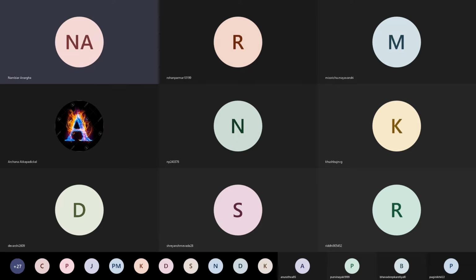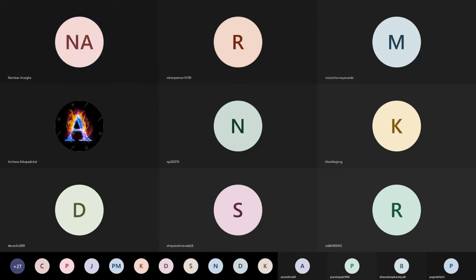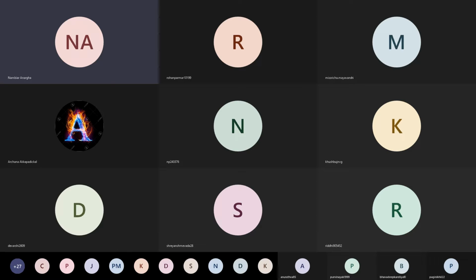हम लोग प्री सैचुरेशन यानी we are pre-saturating it by keeping it for 30 minutes, such that जो भी हमारा मोबाइल फेस है, वो मोबाइल फेस हमने डाला, और उसे बंद कर रखा। तो अब जब बंद करके रखा है तो उस पूरे एनवायरनमेंट में, मेरा एनवायरनमेंट का कहने का मतलब ये है कि उस बीकर के अंदर, in that environment, the environment consists of only the mobile phase molecules, only the mobile phase molecules. It does not interact with anything.